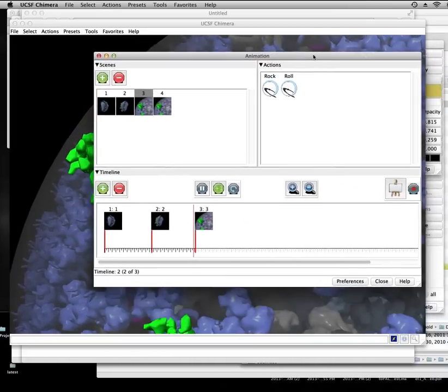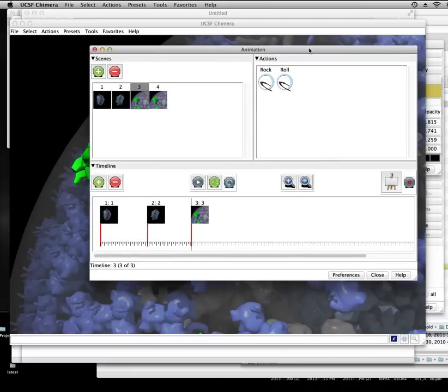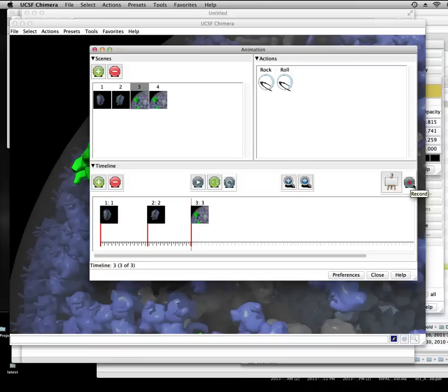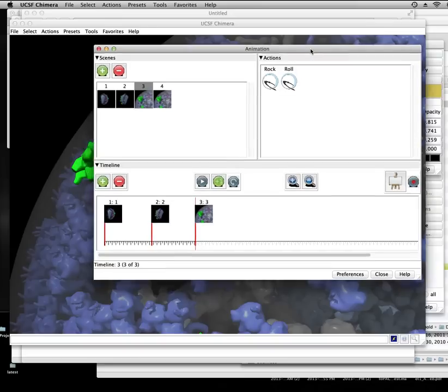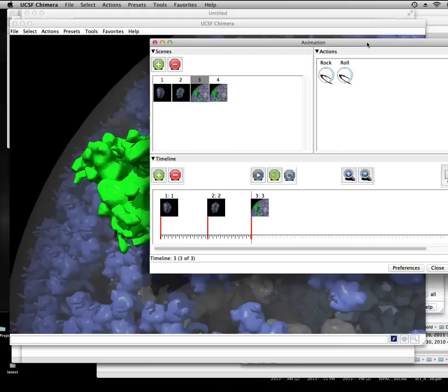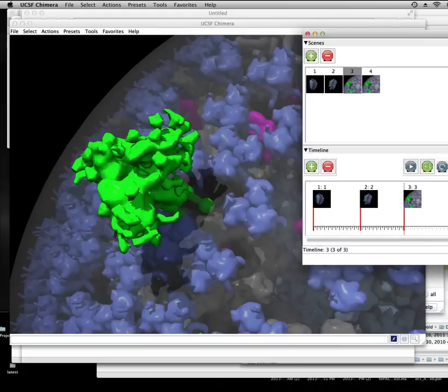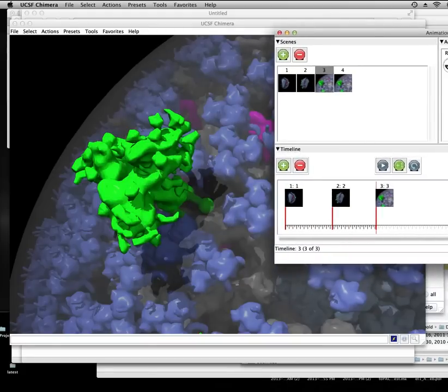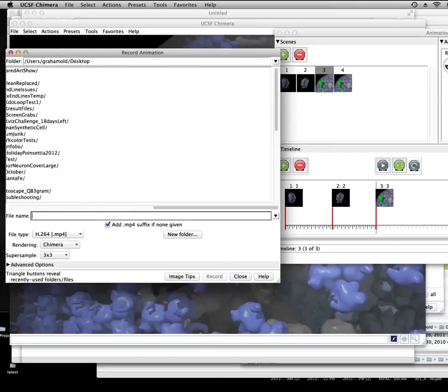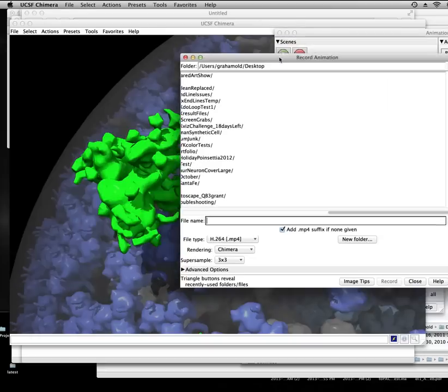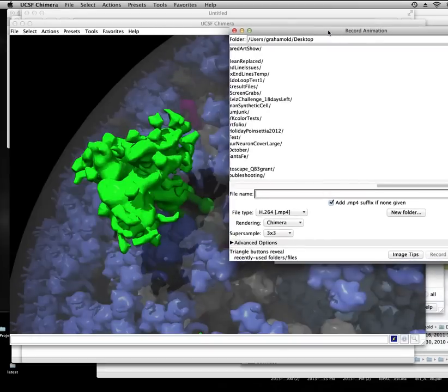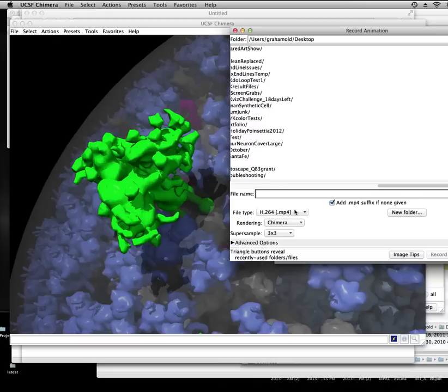You can also do a very interesting thing, which is render out a storyboard, or you can just click this record button. And that will render out your movie as, I believe, an MPEG. I'll double check to confirm. Click record. And oh yeah, I forgot they added this feature so you can actually compress it as H.264. So let's give this a try.